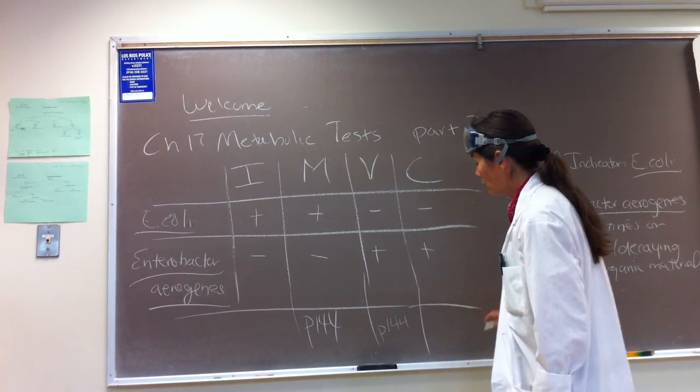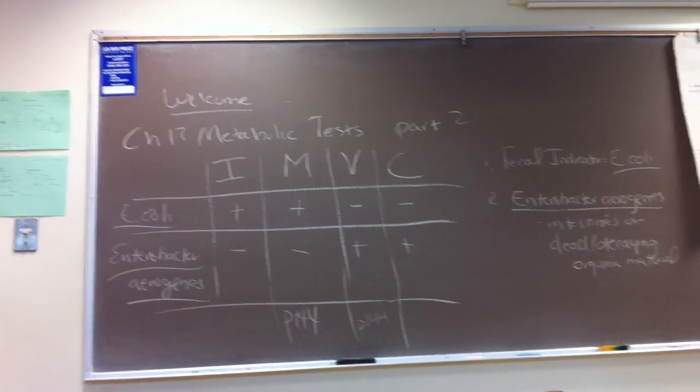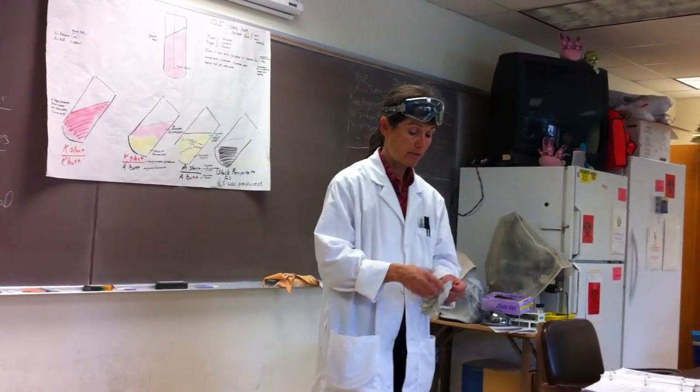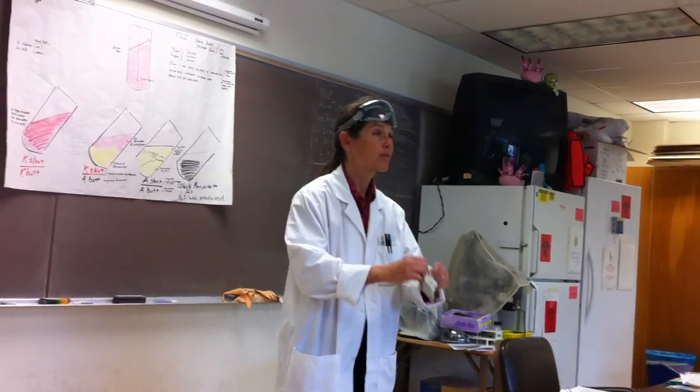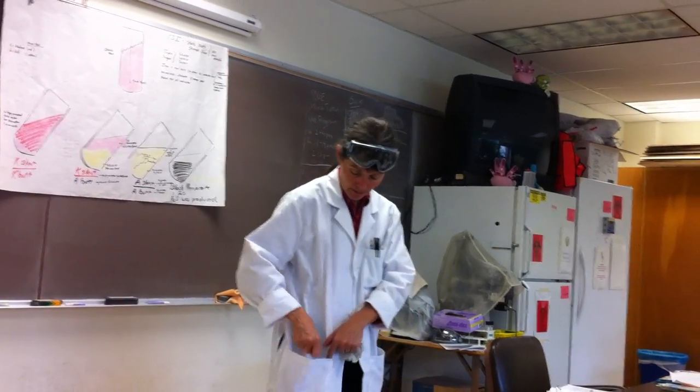So remember, if you're pregnant, you're trying to get pregnant, you think you might be pregnant, or if for any reason you don't want to work with these chemicals, tell me. I'll be your very slow robot, right? So I'll be your hands, but you have to tell me exactly what to do. So let me walk through this with you guys.